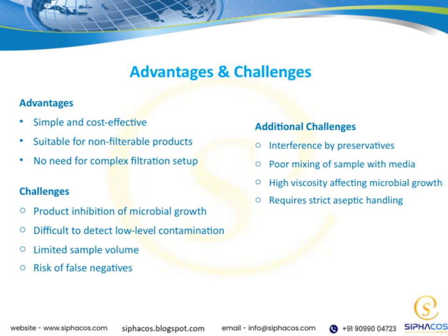Moving on to the advantages and challenges of this method, one big plus is that it's simple and cost-effective. It's also suitable for products that can't be filtered easily, so it has practical applications across different types of samples. Plus, you don't need complex filtration setups, which keeps things straightforward.